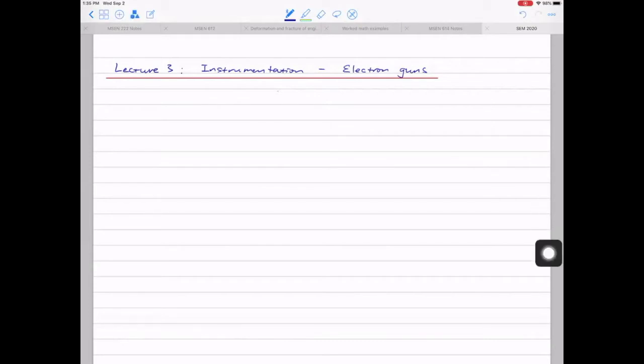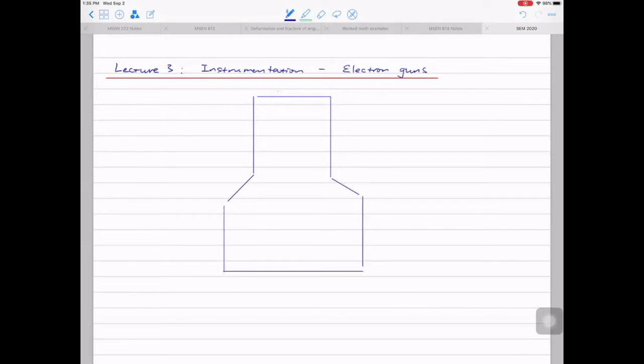So for SEM, as well as TEM, if you take the class later, you can draw that schematically. You have the first part. The first part is the column. And you can draw the second part. The second part is the specimen chamber.